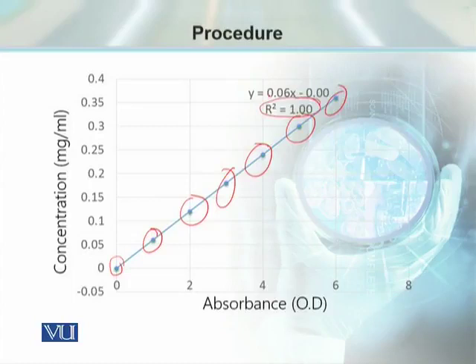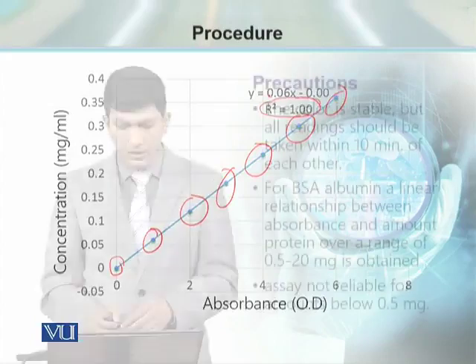And in that case we don't get the optical density, we get directly the concentration of protein per milliliter or per microliter of the sample. जो conventional या simple spectrophotometer हैं, when we go to those, we have to have this standard curve, and then we can take the optical densities from there, and then we can read the concentration from this particular standard curve.